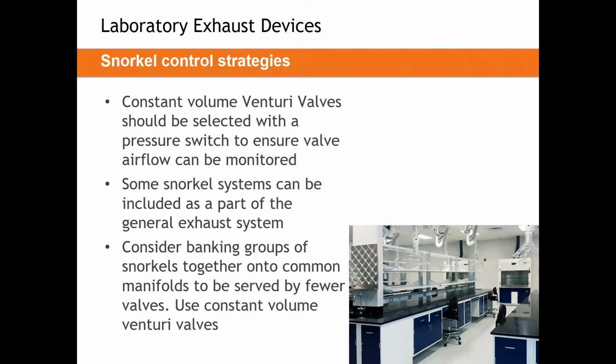Sometimes when we get large numbers of snorkels, so you can see that in the image on the right again, if you get 3, 4, or even 5, 6, or 12 snorkels, you may want to bank them together into manifolds. This will come up mostly in teaching laboratories. A lot of times these teaching laboratories are turned off for the night. They're only used for 3 to 6 hours a week or something like that. We may want to switch those snorkels off. We may also want to deal with smaller class sizes that might come and go as the years pass.